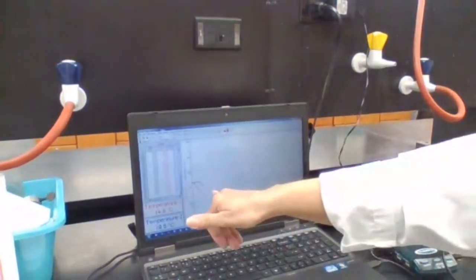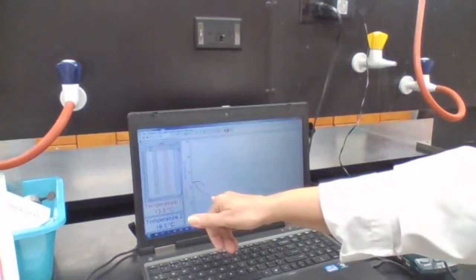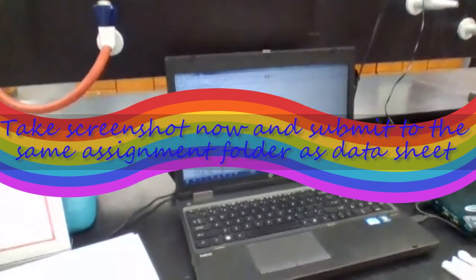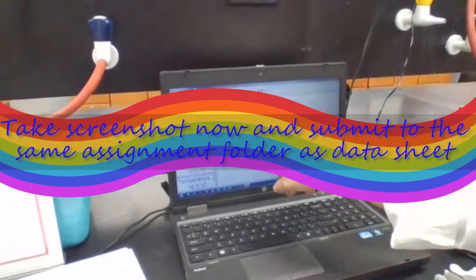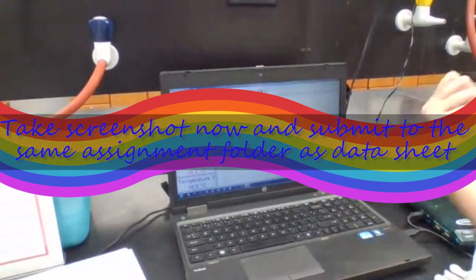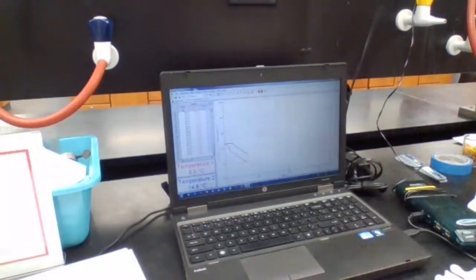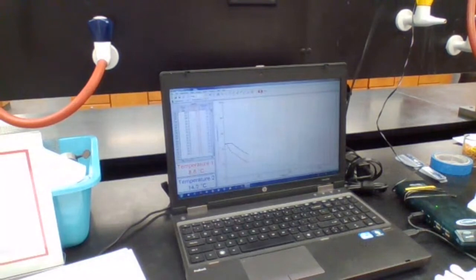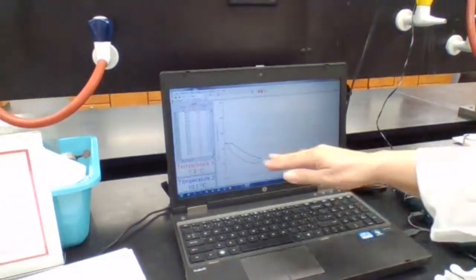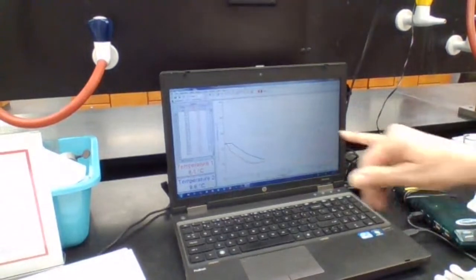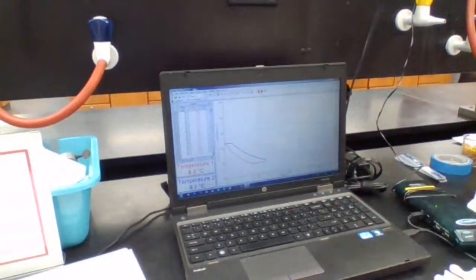Temperature is dropping. You see it's very significant, even more significant than the methanol, because we are dealing with Van der Waals forces or London dispersion forces in this case, which is very weak. Since I waited for the others to get to plateau, I'm going to wait for this one to get to plateau. When the temperature stays constant, then I can.